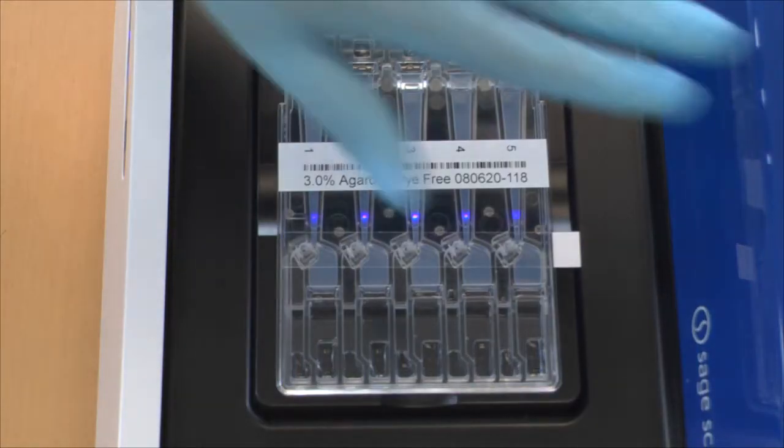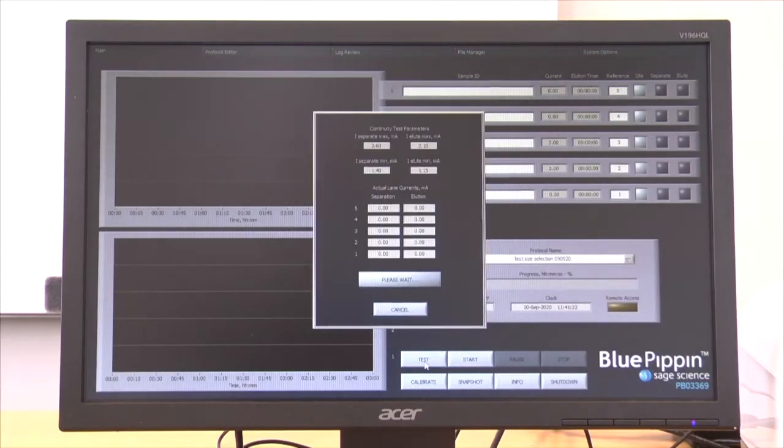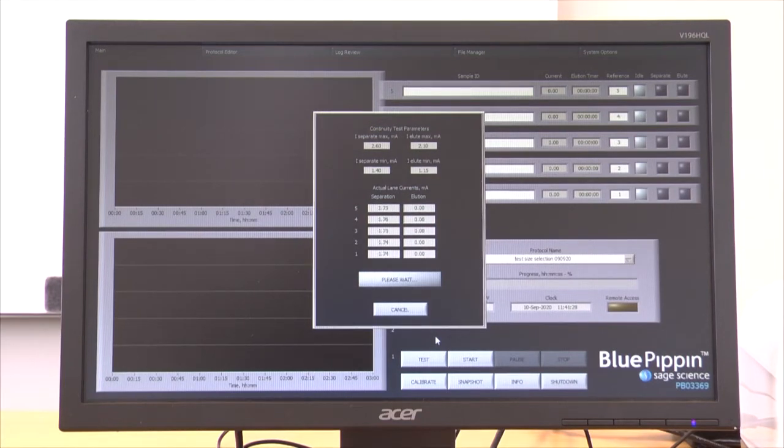Once the cassette is prepared, the lid is closed and an electrical current test is run with software to ensure all electrophoretic pathways are clear of electrical obstructions.